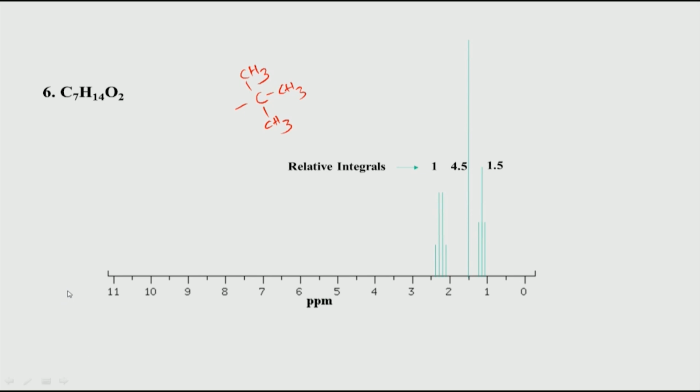If you look at this particular case, you can see here that these 3 methyls are isolated, because this C does not have any hydrogen. The nearest hydrogen could be somewhere here, but that is very far away. Therefore, these 3 methyls are chemically equivalent, and they are not coupled to any hydrogen. So, you expect to get a singlet corresponding to 9. Why 9? Because we have multiplied by 2 to get 2, 9, 3. So, this is one answer for the origin of this peak.